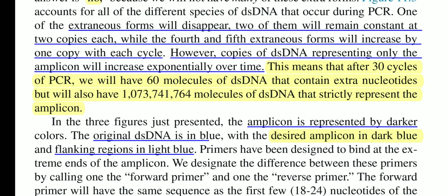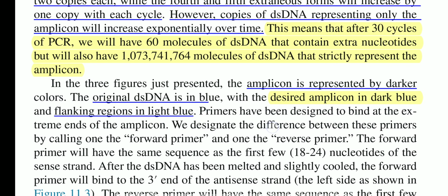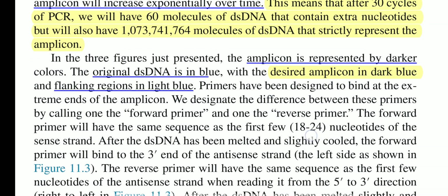That means we have that desired gene amplified in that huge number. It is theoretical, but practically that doesn't happen, because the affinity of the primer to always 100% bind all those fragmented DNA is not always possible. So it is a little bit different. We'll discuss it coming through.